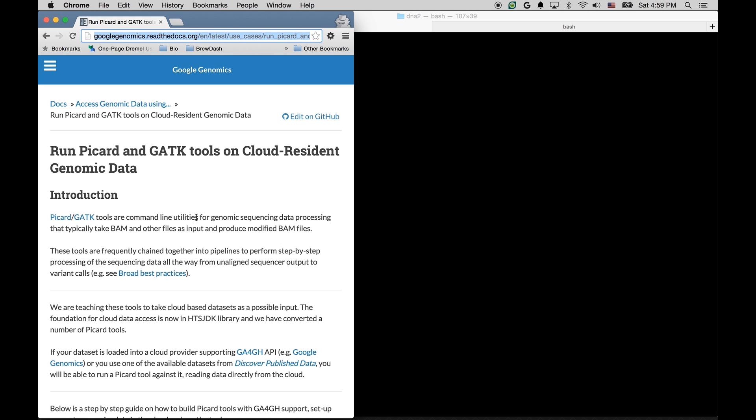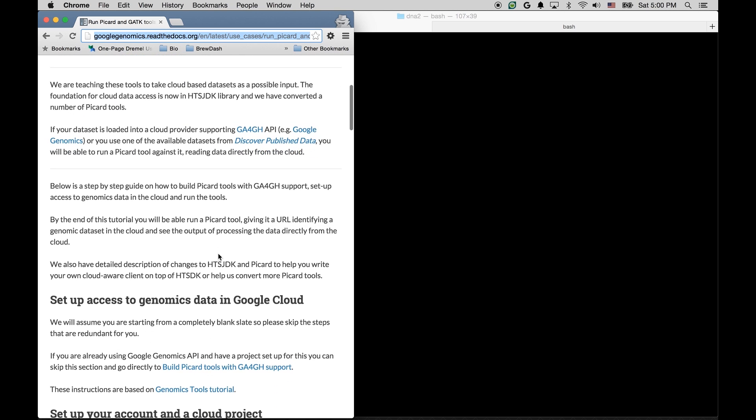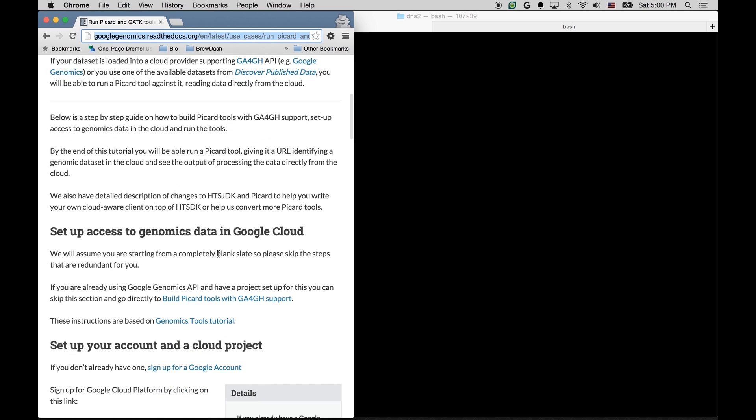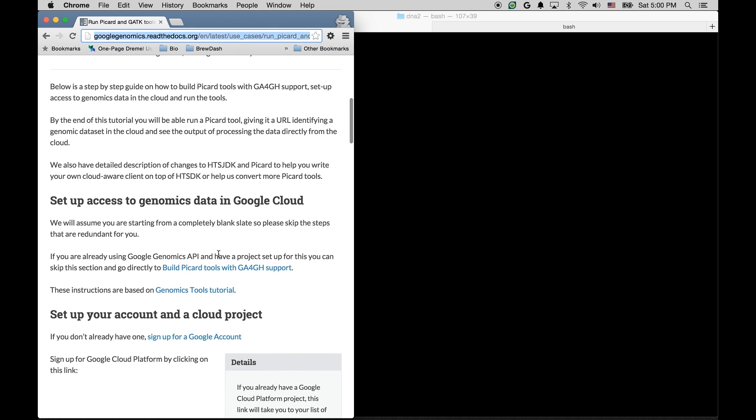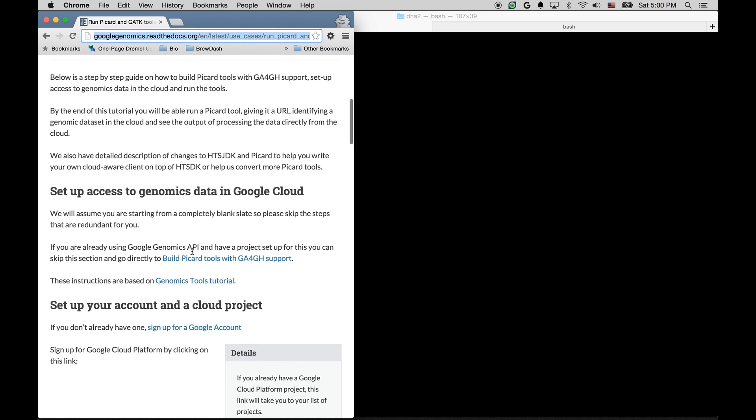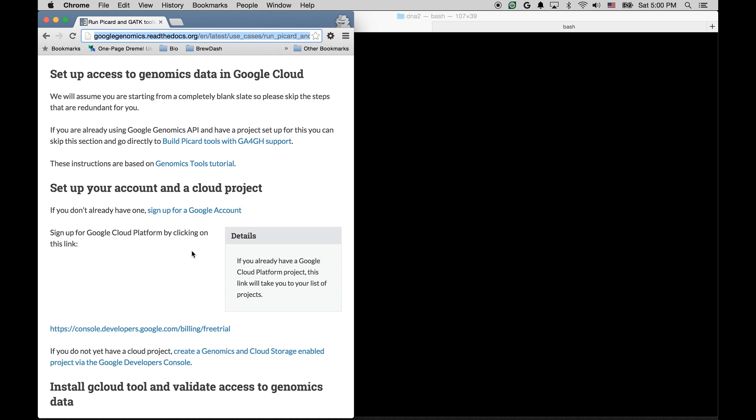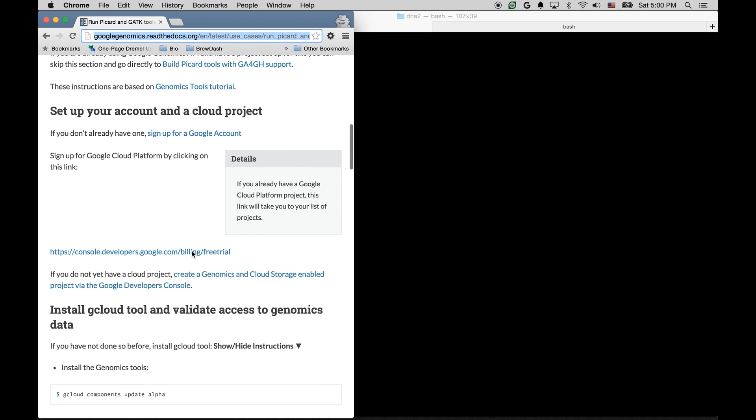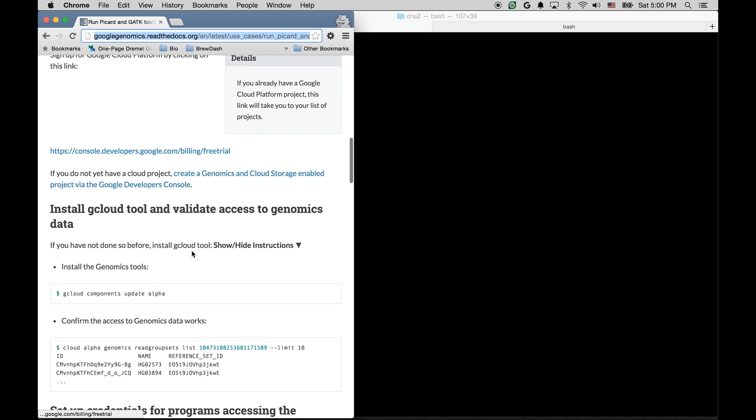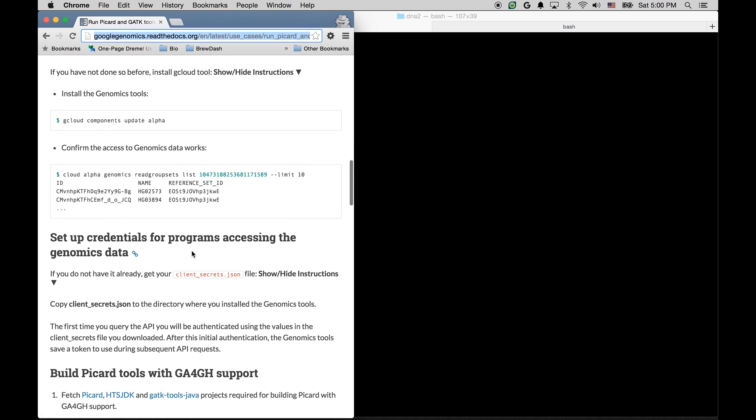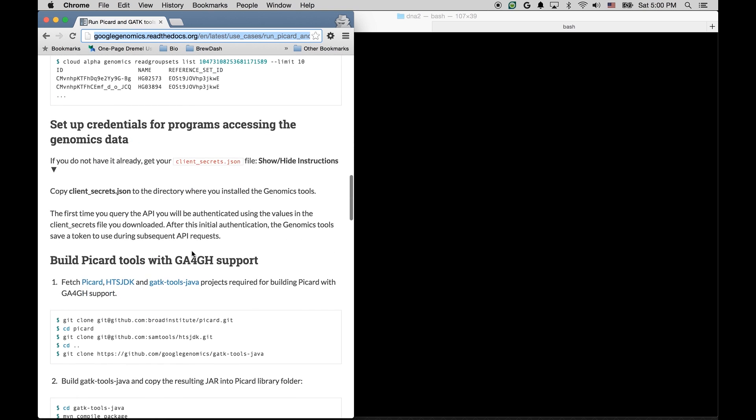Now, these instructions assume you could be starting from scratch, and so they walk you from the very beginning through creating a Google account if you don't have one, to signing up to Genomics API if you haven't done so already, and then creating a project, and then finally setting up credentials, authenticating, and getting access to genomic data. Now, I have already gone through these steps on my machine, but please follow the instructions on the page if you need to do the setup.